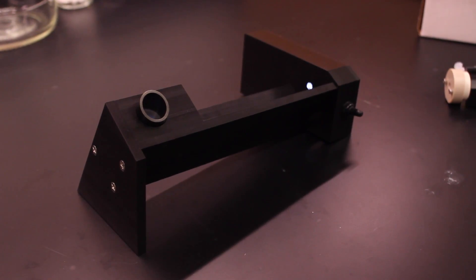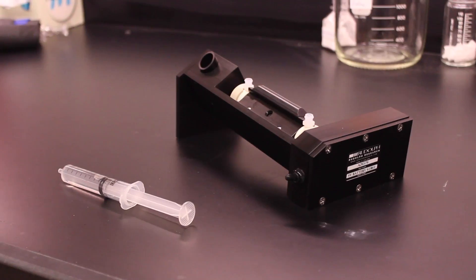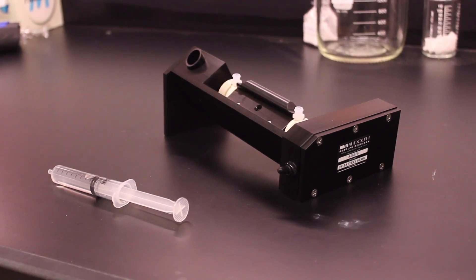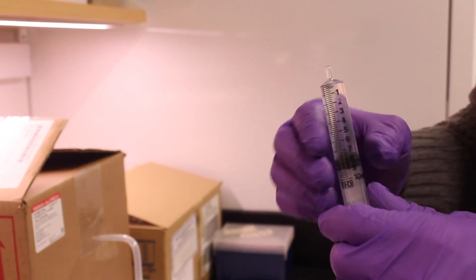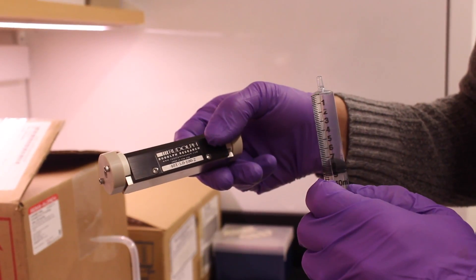We have a convenient cell-filling fixture in the CBIC wet lab that can help ensure that the sample is loaded without any bubbles in the optical path. To use the cell-filling fixture, your sample should be prepared in a syringe capable of holding a volume somewhat larger than the volume of the polarimeter cell that you're using.